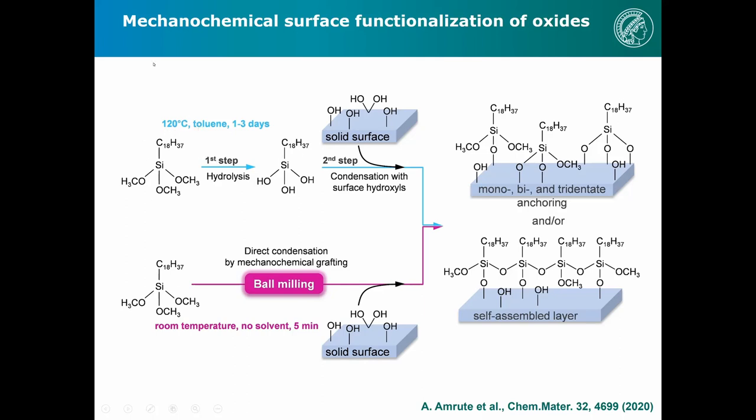You reflux it for one, two, three days. And then you have a surface functionalized with OH groups, which react with the methoxy or the hydrolyzed methoxy groups, and you get an organically functionalized surface. Non-aqueous conditions, absolutely water free, long reaction time. You can do the same at room temperature without any solvent in about 5 minutes. And you get a hydrophobic functionalized oxide.